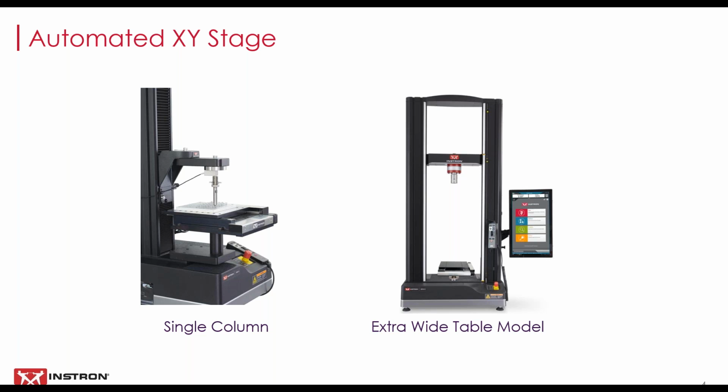The system has a great deal of flexibility and can be used for numerous applications. In a moment, we will discuss applications that can be run on an XY system. As we do, please keep in mind the tests that you run in your lab. Many tension, compression, and bend tests that you run on a manual system can be set up on an XY system, as long as the proper fixturing is used.